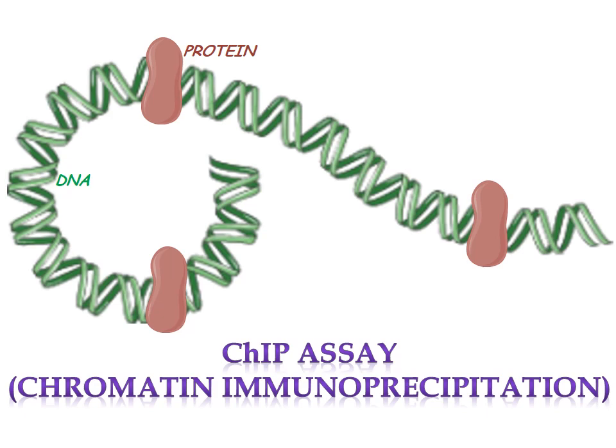Hello friends, in this video we'll talk about chromatin immunoprecipitation assay. The protein-DNA interactions play a crucial role in several cellular functions including gene transcription, DNA replication, DNA repair, cell cycles, etc. The ChIP assay is one of the powerful techniques to examine such interactions in intact cells.